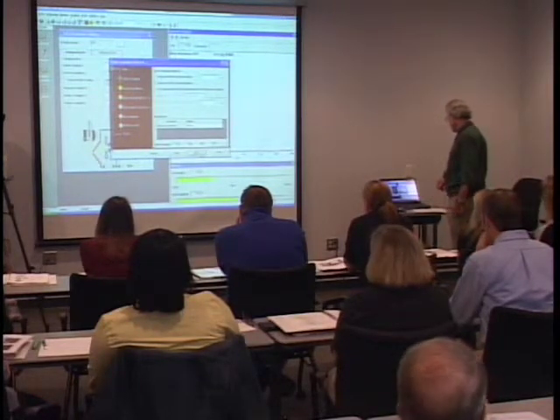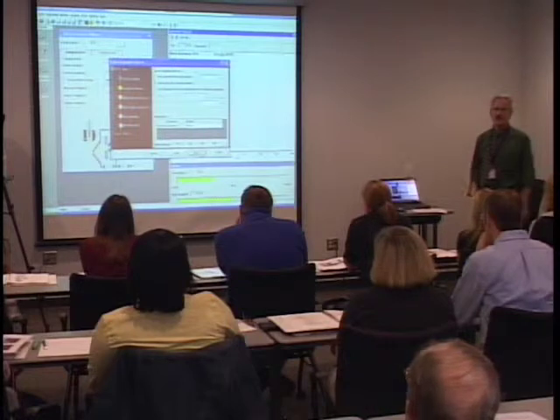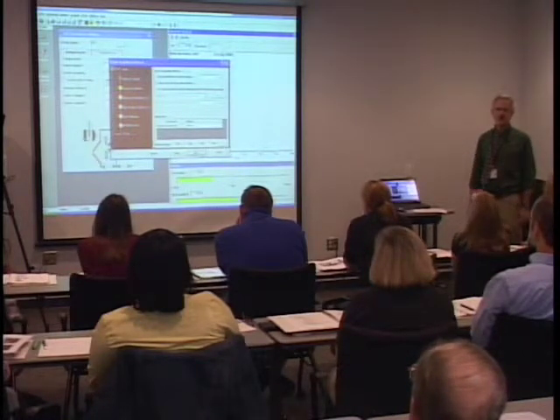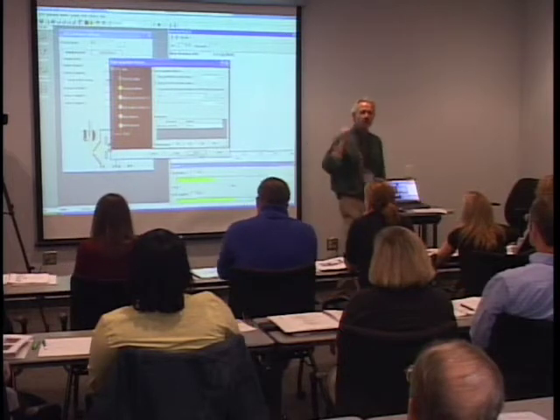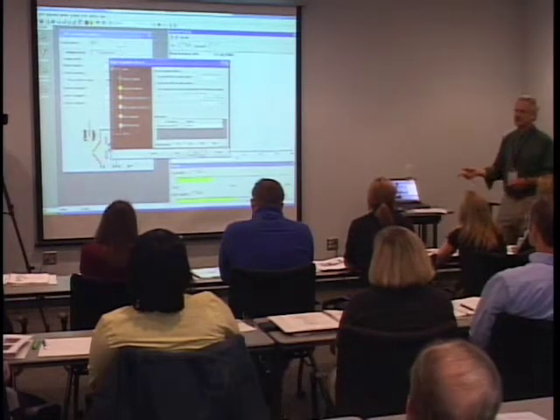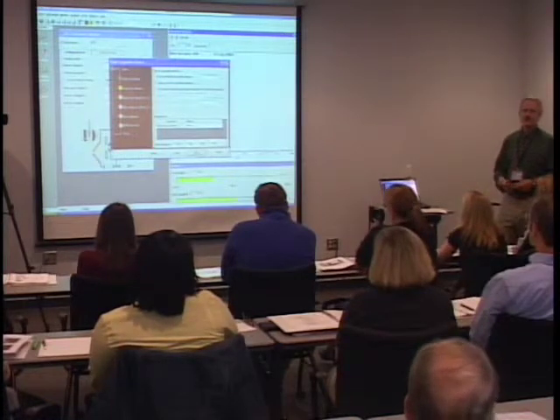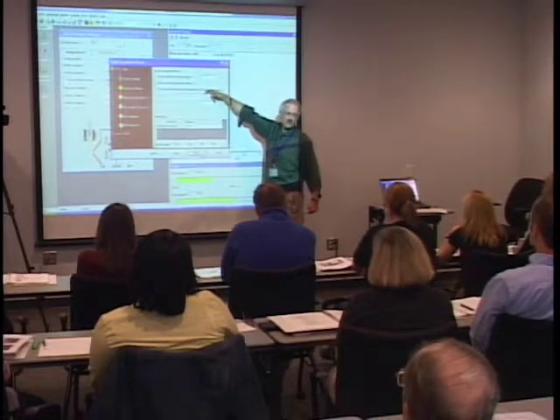On the next page you get three choices of how to set up the data. The first is just use whatever parameters you see on the screen and save data that way. I like to use the middle one, which allows you to specifically view what parameters you're going to use that day — mass range, storage speed, and how long the spectrum will run. The third is to use a previously existing program. We haven't created a program yet, so we'll ignore that. We're going to use the middle one just so you can see what it's doing.